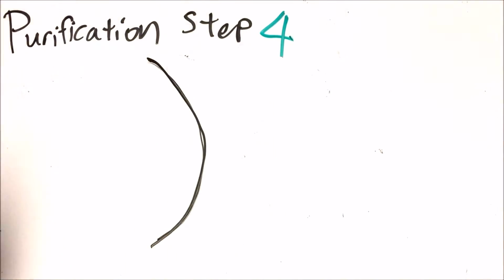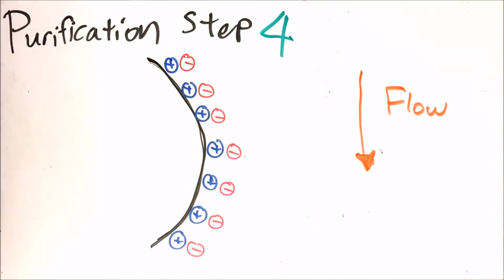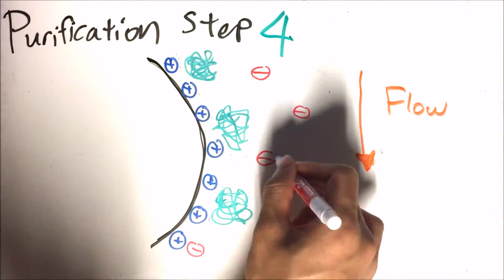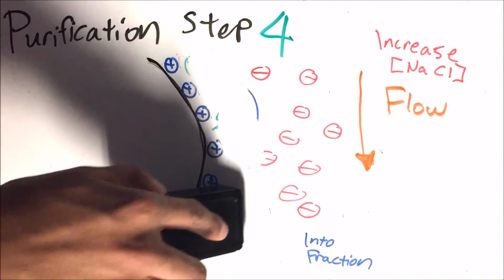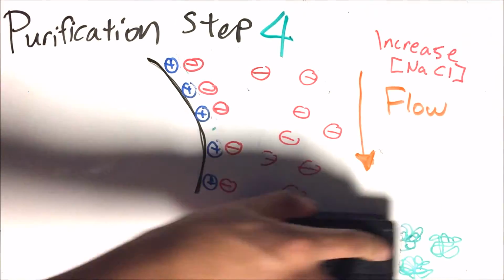The anion exchange column is a form of liquid chromatography where the column is filled with beads that hold positively charged ions to bond with negatively charged molecules moving through the column. Negative ions in the mobile phase, including our protein AP, will bind to these beads. As the conductivity increases, chloride ions wash off our protein into our fractions.